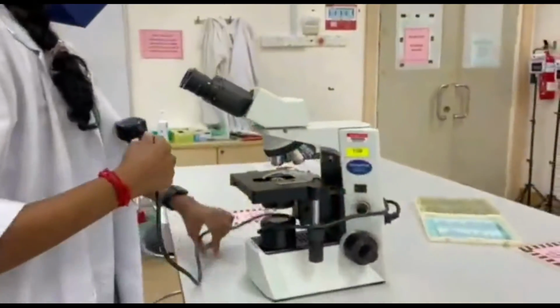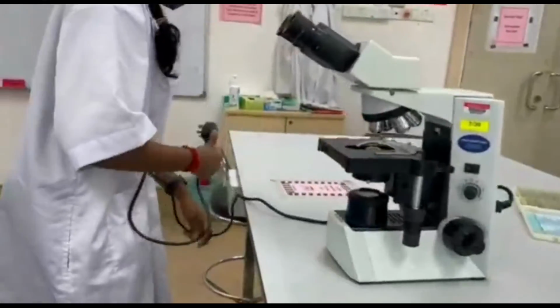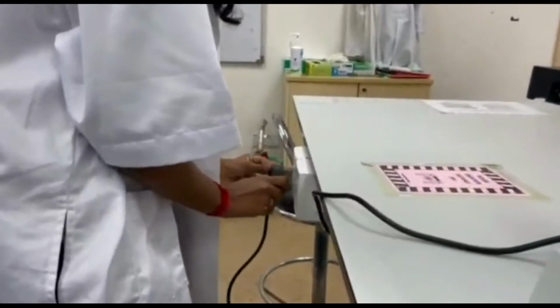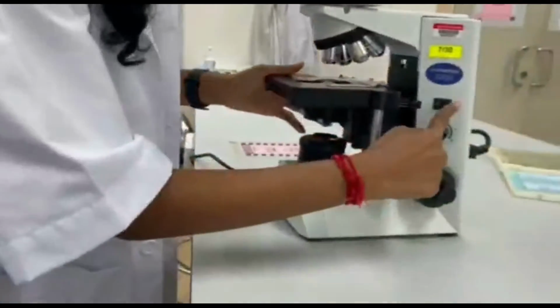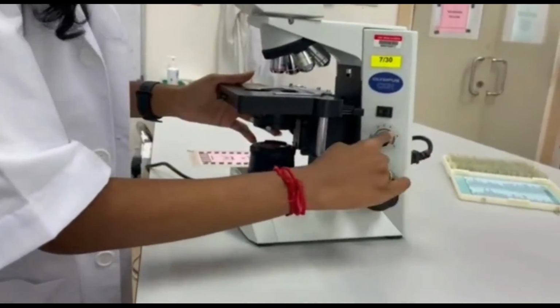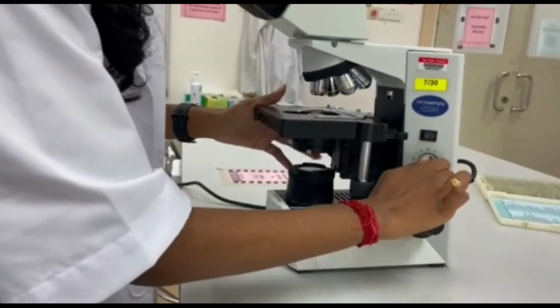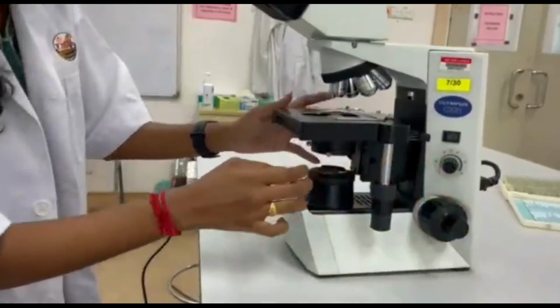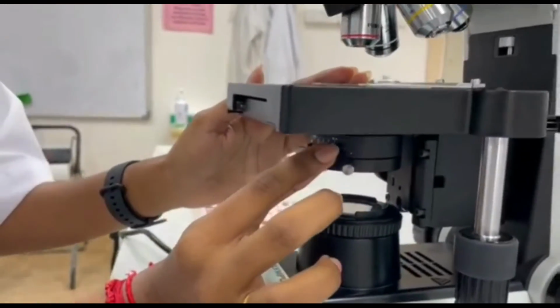To set up a light compound microscope, first plug the microscope into a power source. Next, check that the light switch is off or the light control knob is set at minimum. Turn on the light switch. Adjust the light control knob or adjust the light diaphragm to deliver light to the specimen field.